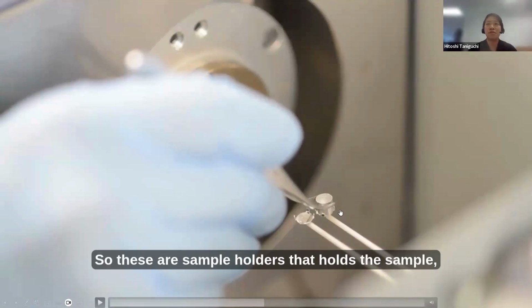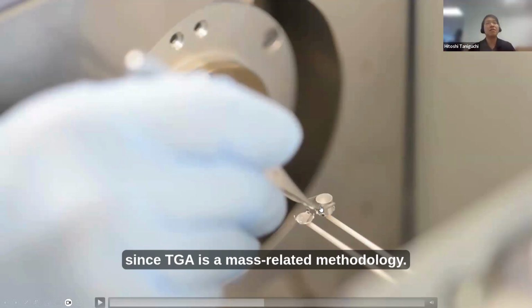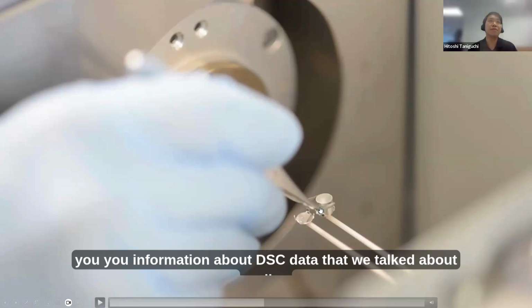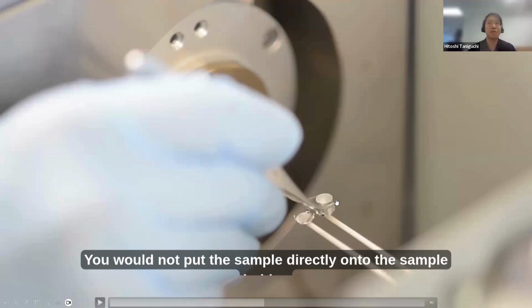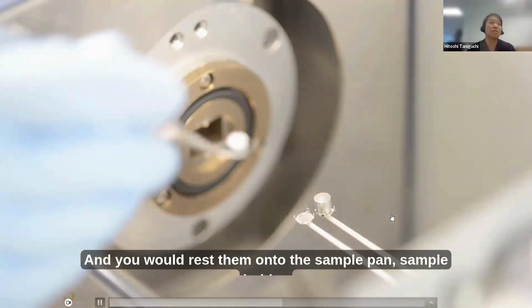These are sample holders that hold the sample, and they double as the scale for the TGA, since TGA is a mass-related methodology, and they also double as the thermocouple. That would give you information about the DSC data that we talked about earlier. This right here is a sample pan. This is where you would put in the sample. You would not put the sample directly onto the sample holder; you would rest it in the sample pan, and rest that onto the sample holder like this.